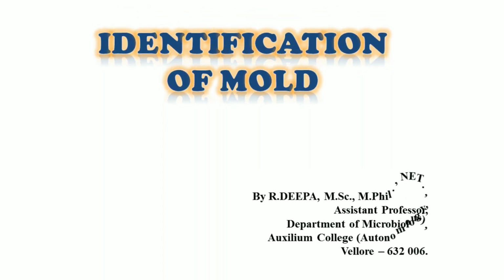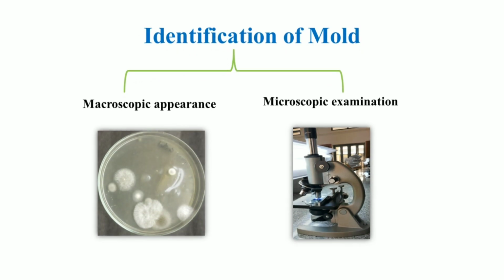Identification of mold. Identification of mold based on the macroscopic appearance by observing the colony morphology on solid media and microscopic examination using lactophenol cotton blue test.